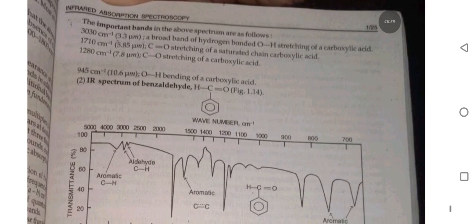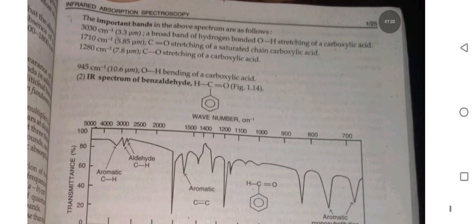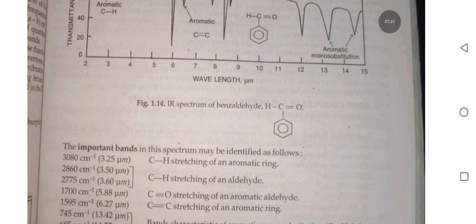3030 cm inverse, a broad band of hydrogen bonded OH stretching of a carboxylic acid. 1710 cm inverse, C double bond O stretching of a saturated chain carboxylic acid. 1280 cm inverse, CO stretching of a carboxylic acid. 945 cm inverse, OH bending of a carboxylic acid. IR spectra of benzaldehyde.